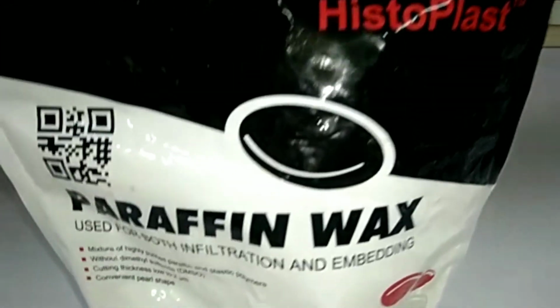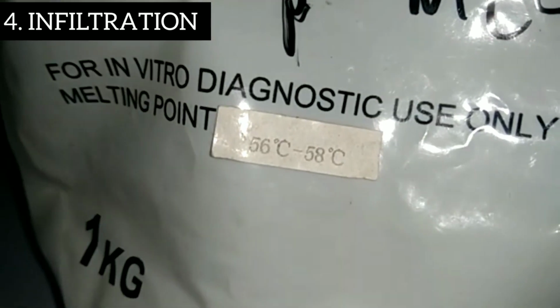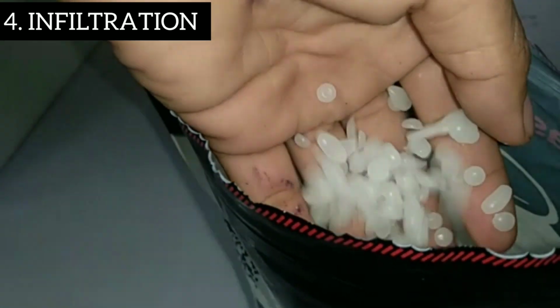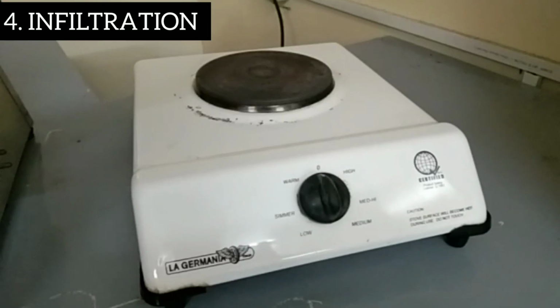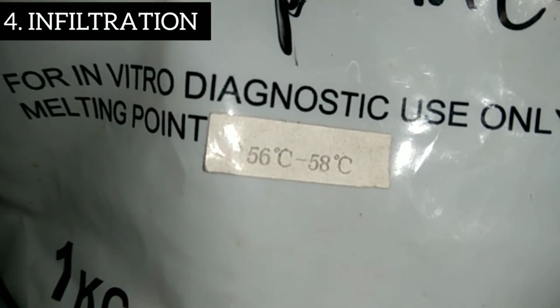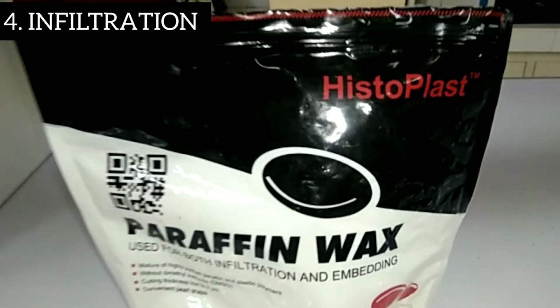The next step is infiltration. Infiltration or impregnation is the process of saturating the tissue with a medium, usually liquid paraffin, to permeate or fill up the natural cavities, spaces, and interstices of the tissue. This will allow the tissue to harden and prevent distortion of the specimen during sectioning. Usually, paraffin wax is heated to a temperature of 2 to 3 degrees Celsius above its melting point. Note that the melting point of paraffin wax may differ depending on the manufacturer.